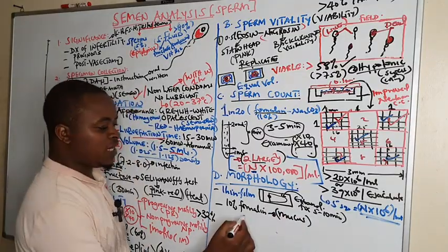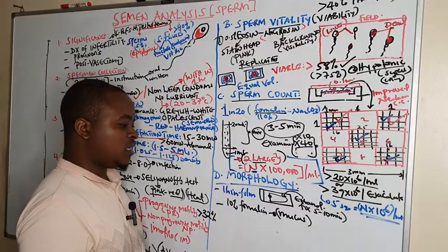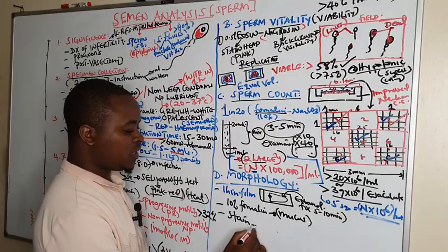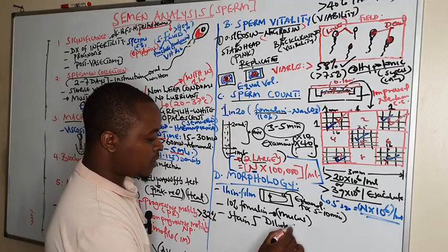After treating it with 10% formalin with sodium bicarbonate, which is acting as a buffer, we are going to stain. And how do we stain? We can use this primary stain, dilute carbol fuchsin.